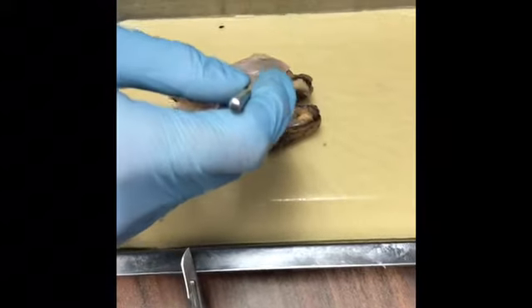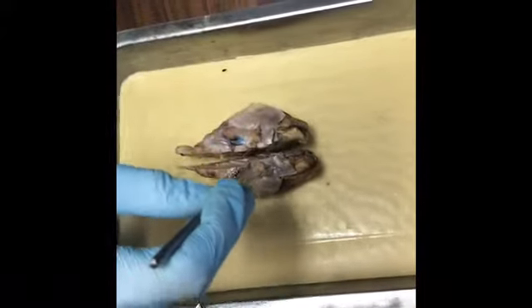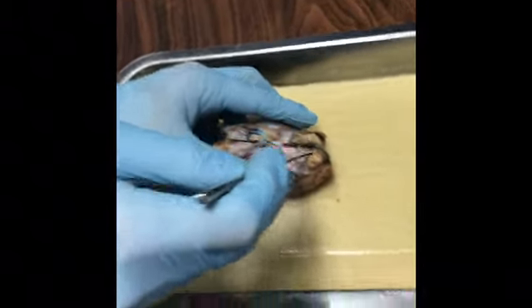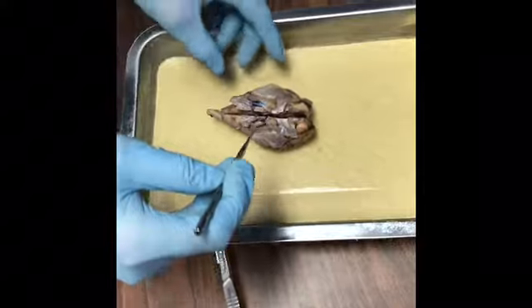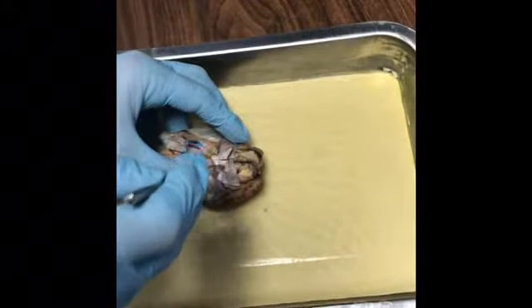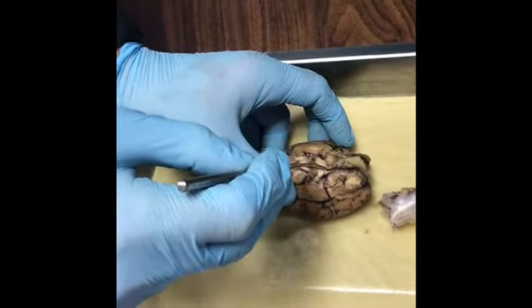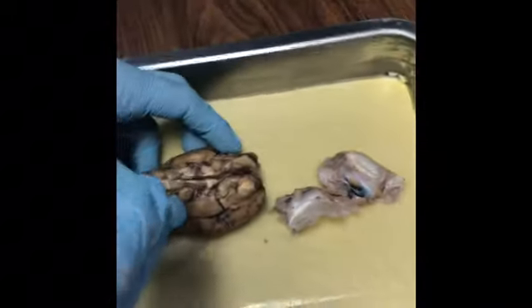So next thing I want to show is the olfactory and the cranial nerves, and that is located here, and that's the olfactory bulb. The connection is the olfactory nerve, and then the optic nerve, which is this part right here, which is cut off. And then where it makes the X, where those pieces would be connected, that is the optic chiasm. And then this bottom part here is the optic tract.